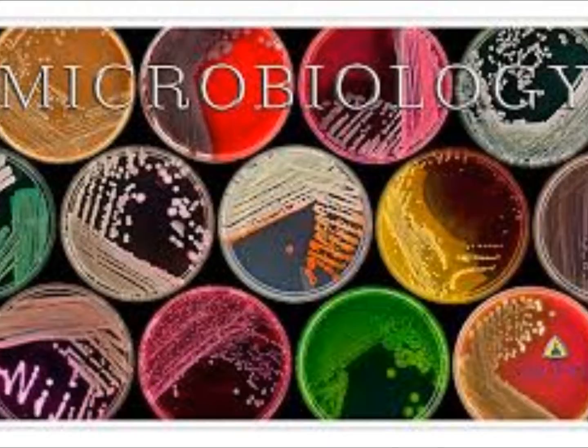So you're responsible to clean your trays at the end, and then you can set your reagents right in the tray and just keep that at the top of your desk. Let me give a little set of tweezers per table that you can keep with it.